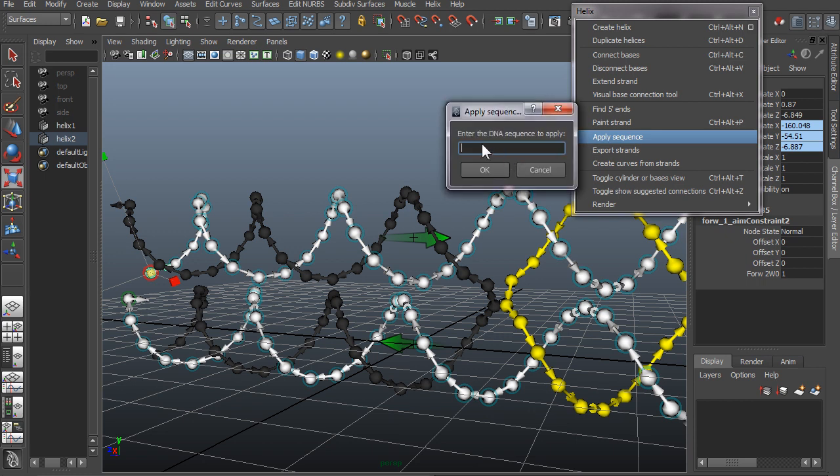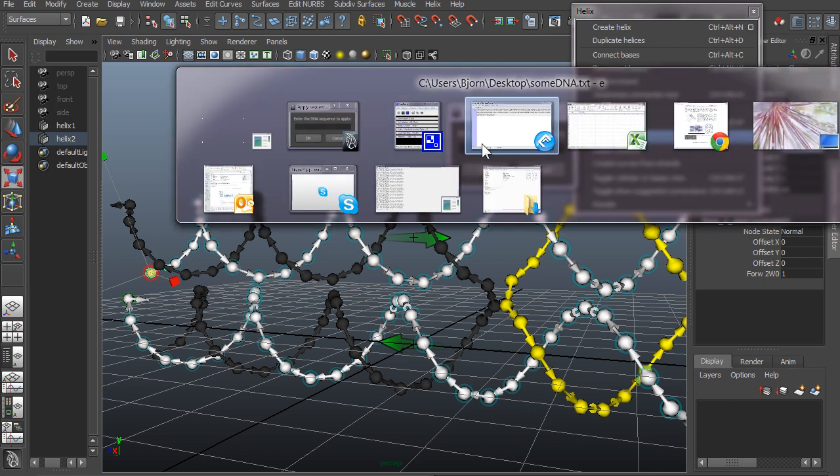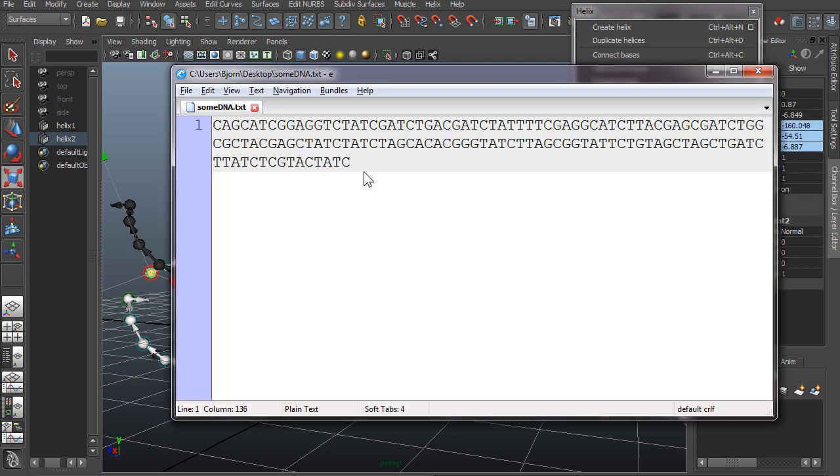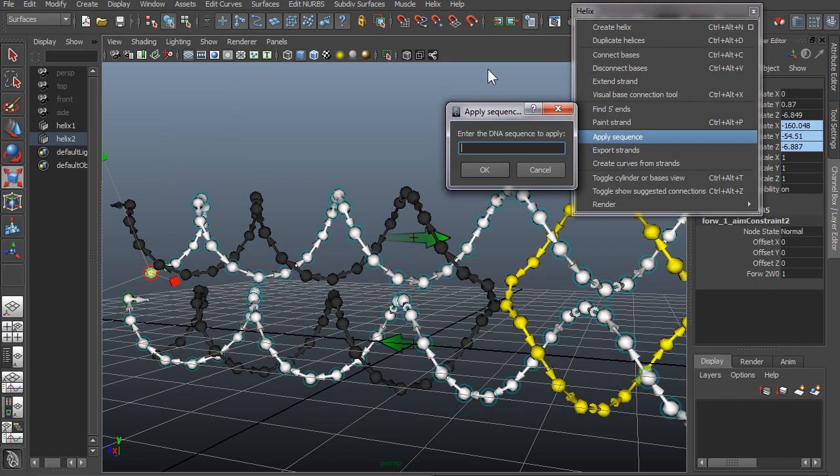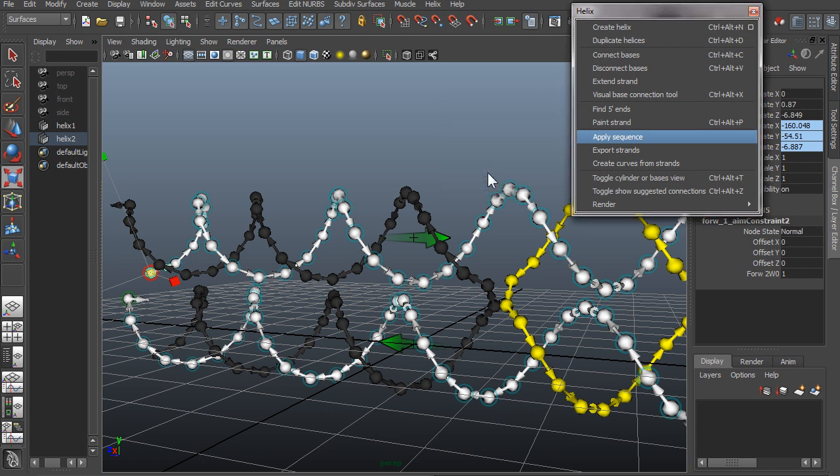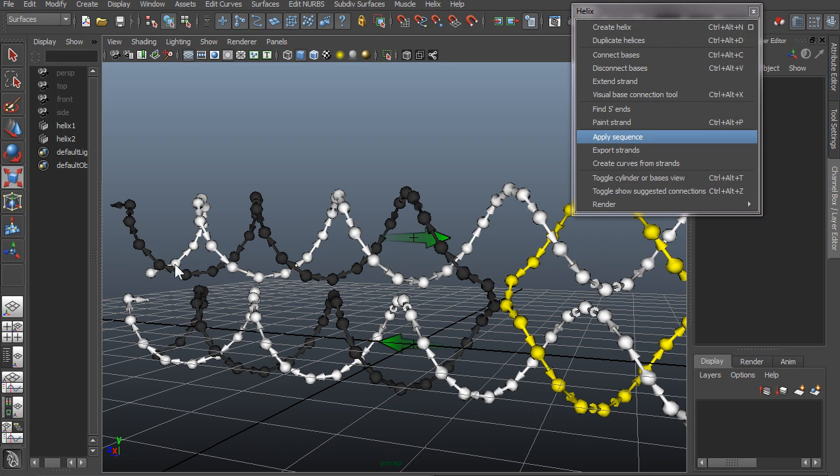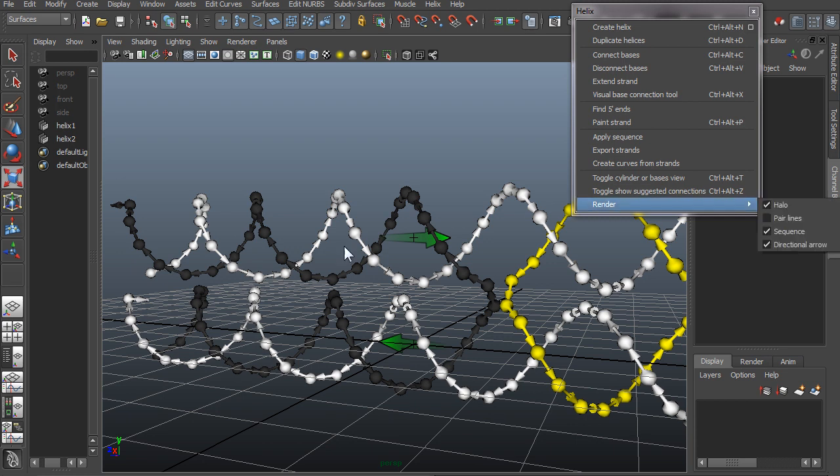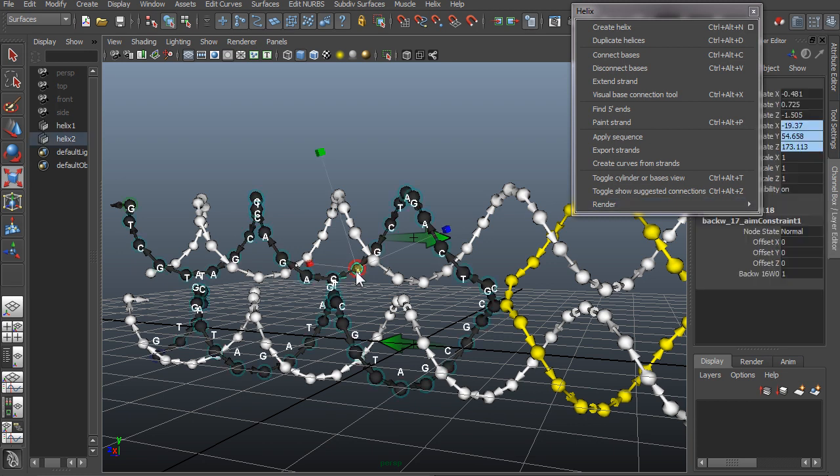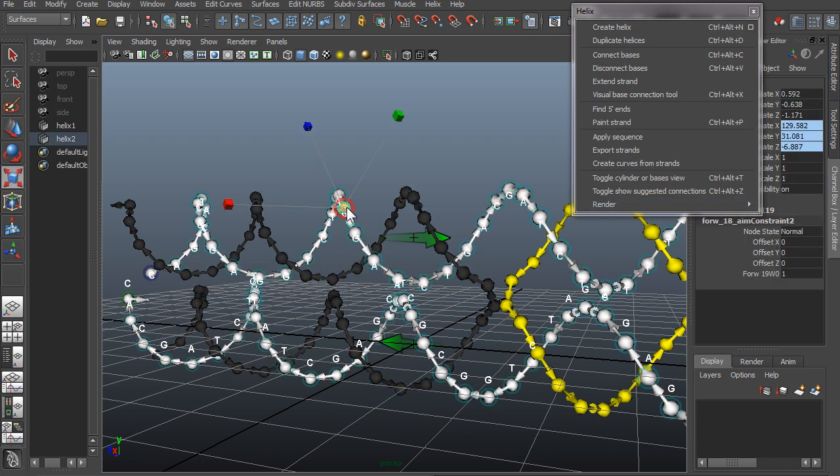And here I'm going to just copy some sequence that I had and then enter that sequence here. And now nothing really happened here, but if we turn on render sequence and then check the strands, you see that the sequence is actually applied now.